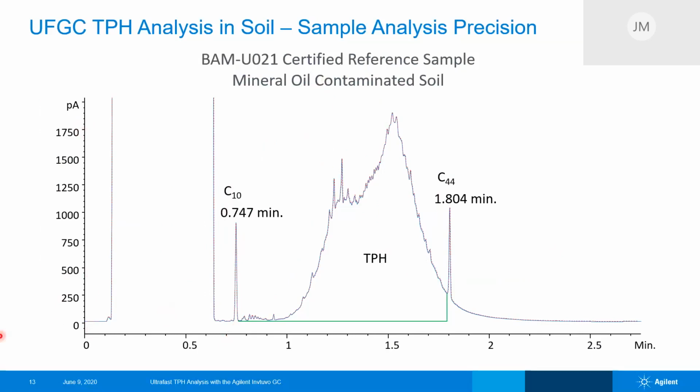So we're getting exceptionally good precision on our retention times, and also we're not getting any inlet discrimination or removal of the higher boiling components.